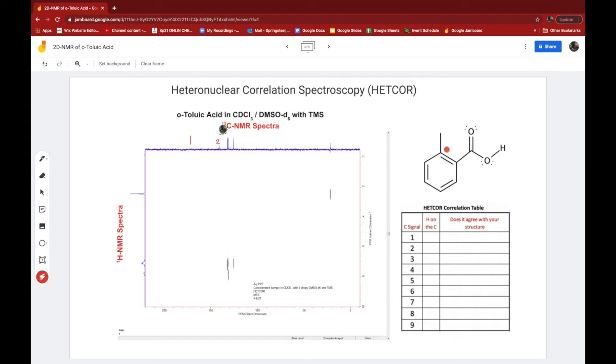They're these ones, all in the aromatic region. Those ones have just single hydrogens, if you remember. And then we have 6, another short one. That's a carbon without a hydrogen, one of those 2. Then 7, and then finally 8. The methyl is 8 there, and that corresponds down to about 20.